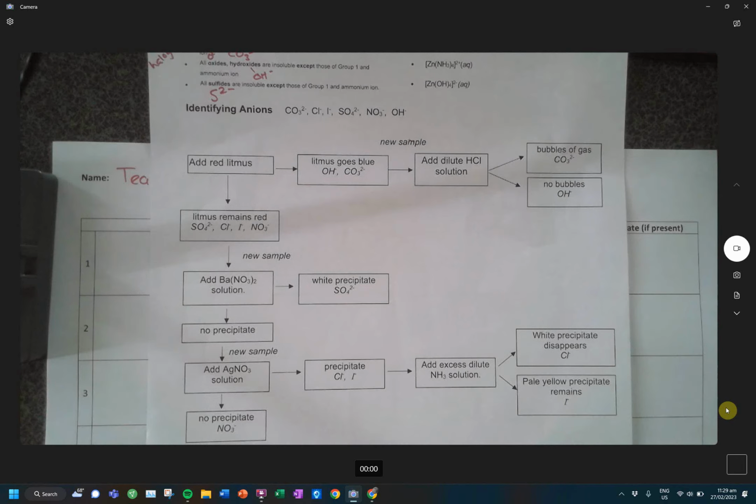And there's one more thing I forgot to add. I'll go grab it. And that is going on this line here. That is dilute hydrochloric acid. So those are the 1, 2, 3, 4, 5 things I need in my box. Yep. So these are the reagents I need to test for an anion.